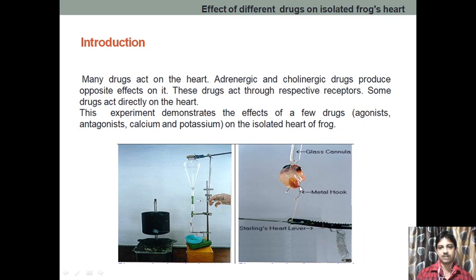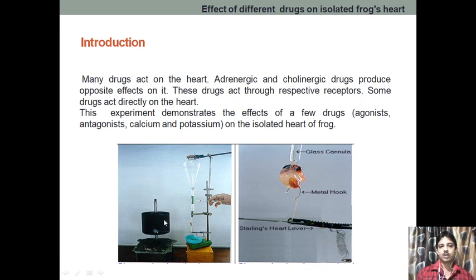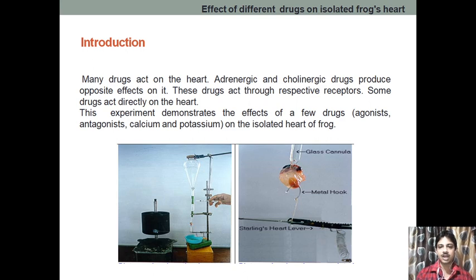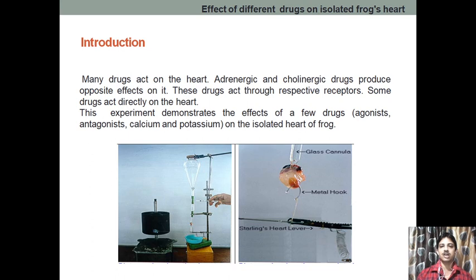The ventricular part is attached with a metal hook, which is connected to the Sterling heart lever, and the Sterling heart lever is attached to the kymograph drum. On the kymograph drum, there is continuous contraction and relaxation of the heart, and whenever we inject the drug, depending upon the drug's nature, either the contraction will increase or the contraction will decrease.